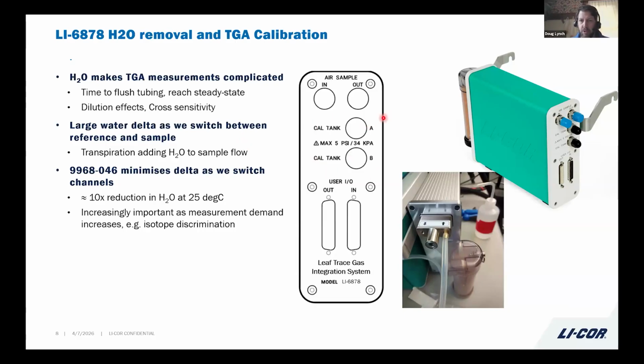The other capability that this dryer box provides, as I mentioned earlier, is the ability for the user to connect a few calibration tanks, and those calibrations can be automated as part of the workflow if the user so desires.